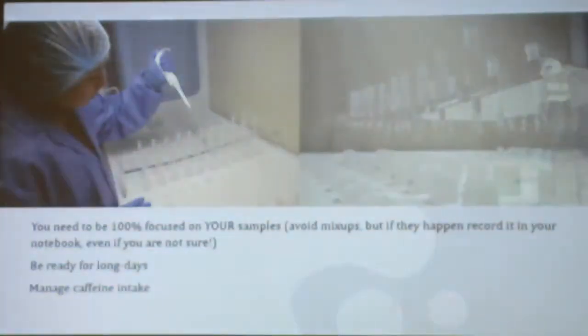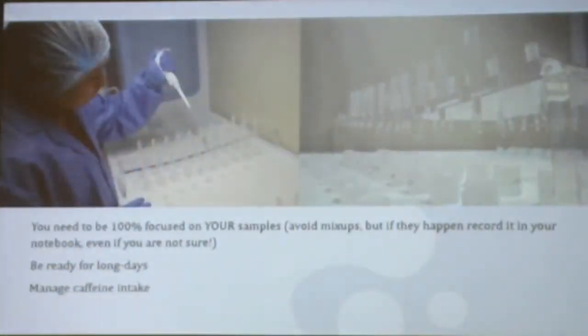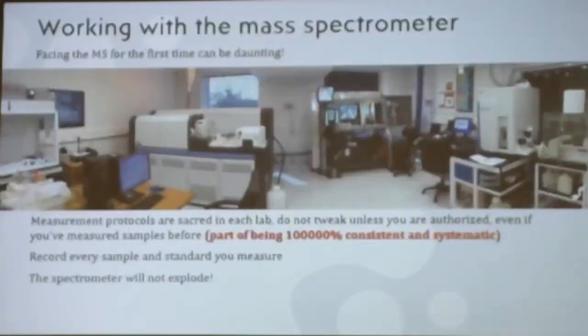You need to be focused on your samples. So we usually tell students who are coming to the clean lab to just forget about life. Enjoy the clean air, relax, put on some music. Very important, manage your caffeine intake. And I'm serious. Why? Because you will be pipetting into different columns, and if you take 5 cups of coffee prior to your lab work, you'll be shaky. I'm talking from experience, so yes, manage it.